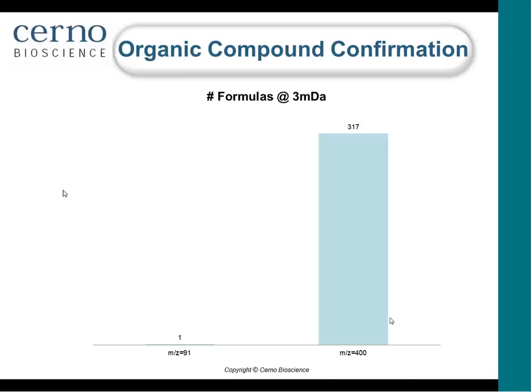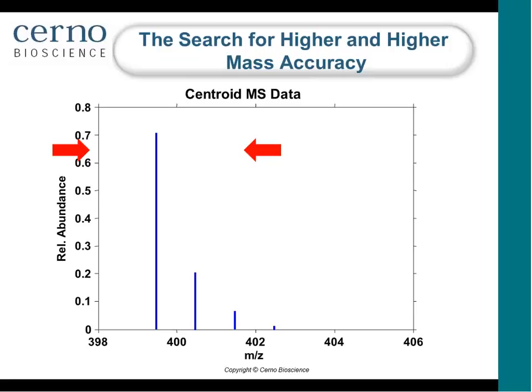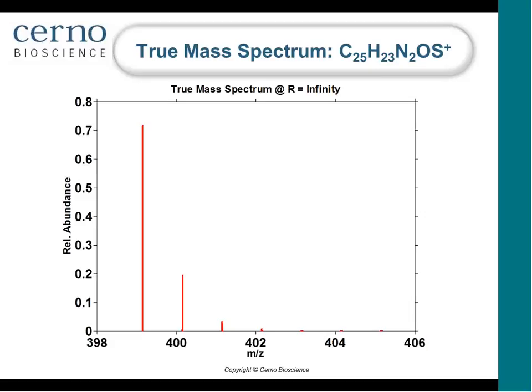And because of that, the industry has moved to develop higher and higher resolution systems with higher and higher mass accuracy, by focusing somewhat exclusively on determining the mass accurately for the monoisotope peak of a compound. And there has been tremendous progress made to make that single point measurement more and more accurate. In the process, some of the other important information in the spectral domain has been pretty much ignored, unfortunately.